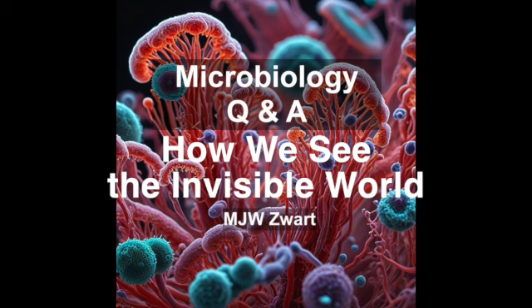And what's the other type? The atomic force microscope, or AFM, which works a bit differently. The AFM uses a sharp tip attached to a tiny cantilever, a bit like a miniature diving board. I can picture that. As the tip scans across the surface, it encounters forces from the atoms on the sample, causing the cantilever to bend.